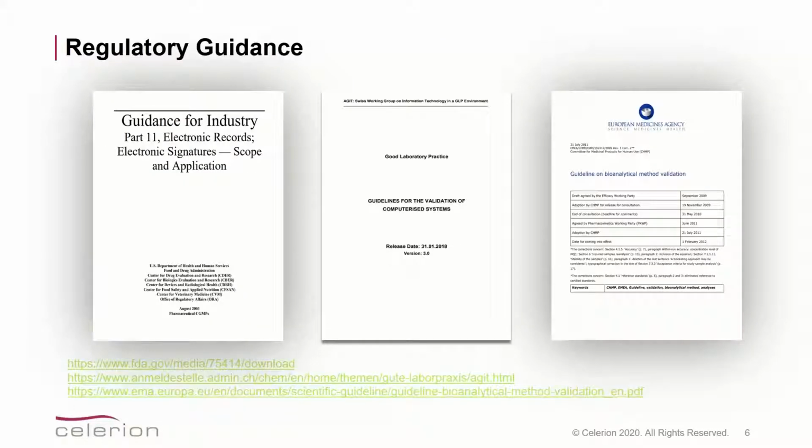Now, shortly about the regulatory guidances. First of all, authorities and customers expect implementations in compliance with regulations, which in this case includes both the aspects of computerized system validation, here represented by the FDA guidance on Part 11 compliance and the AGIT guideline for computerized system validation, combined with all the aspects of bioanalytical method validation as per the EMA guideline.